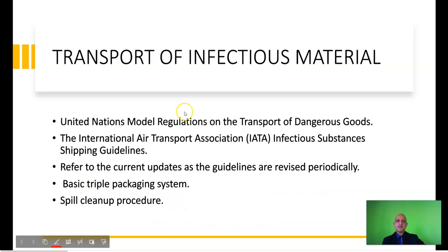Okay, these are some of the references. International Air Transport Association, IATA Infectious Substances Shipping Guidelines, and they are updated regularly, and you need to refer to the current update in order to obtain the latest guidance. And there is what is known as a basic triple packaging system, which I will discuss in the next slide.